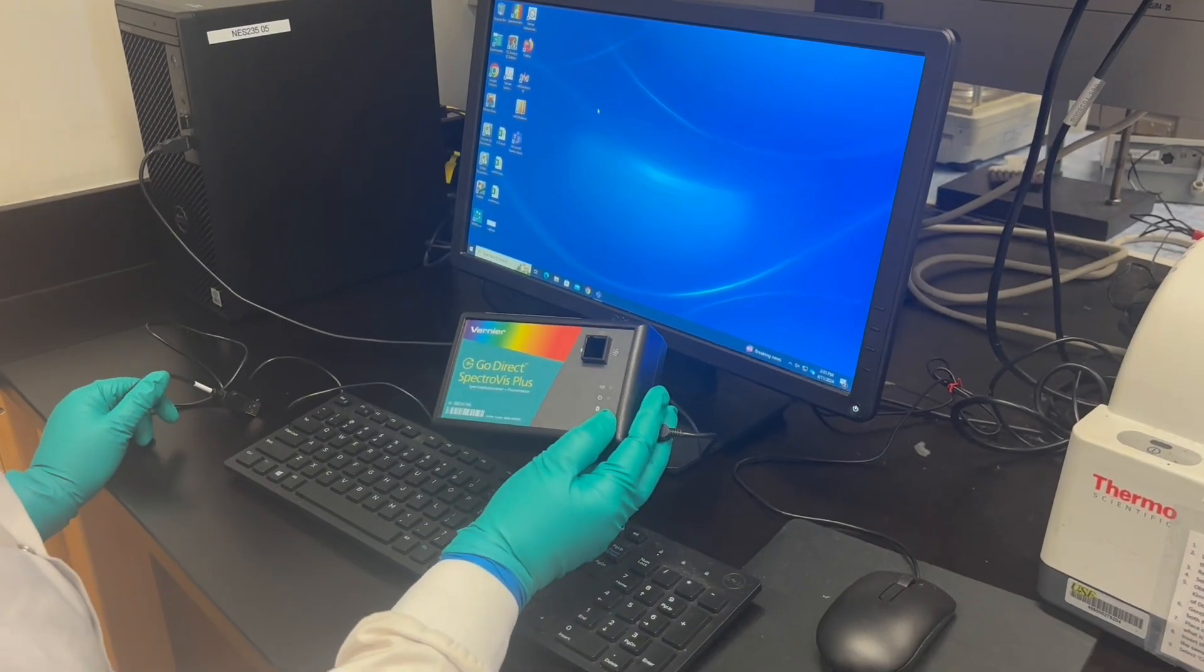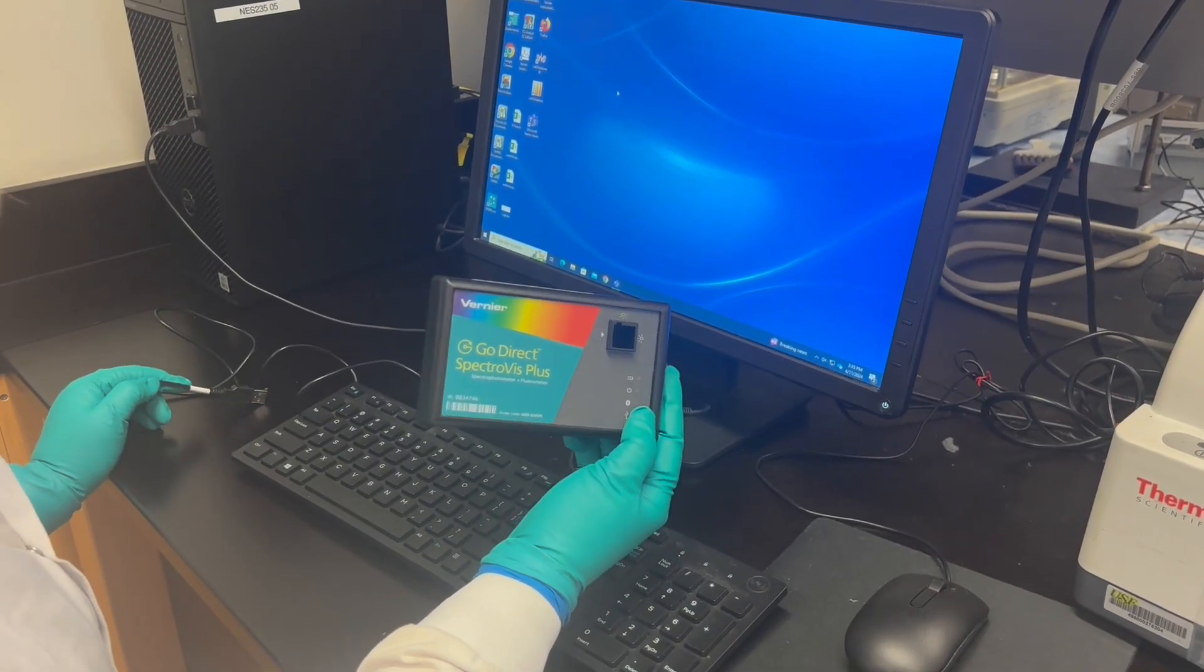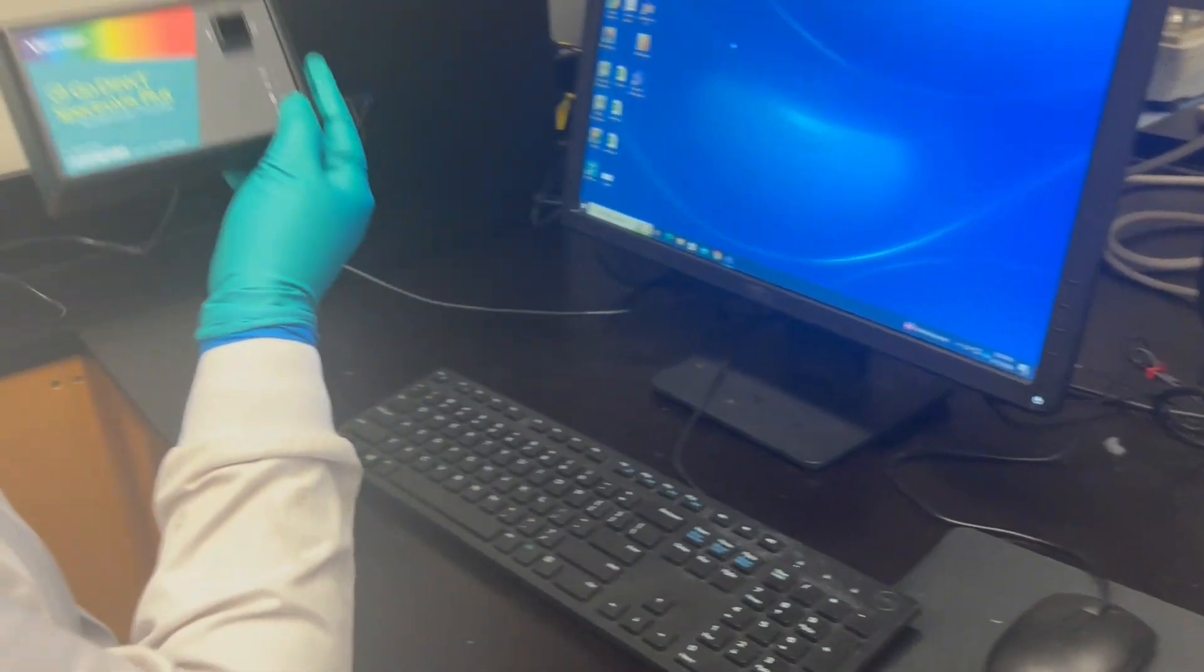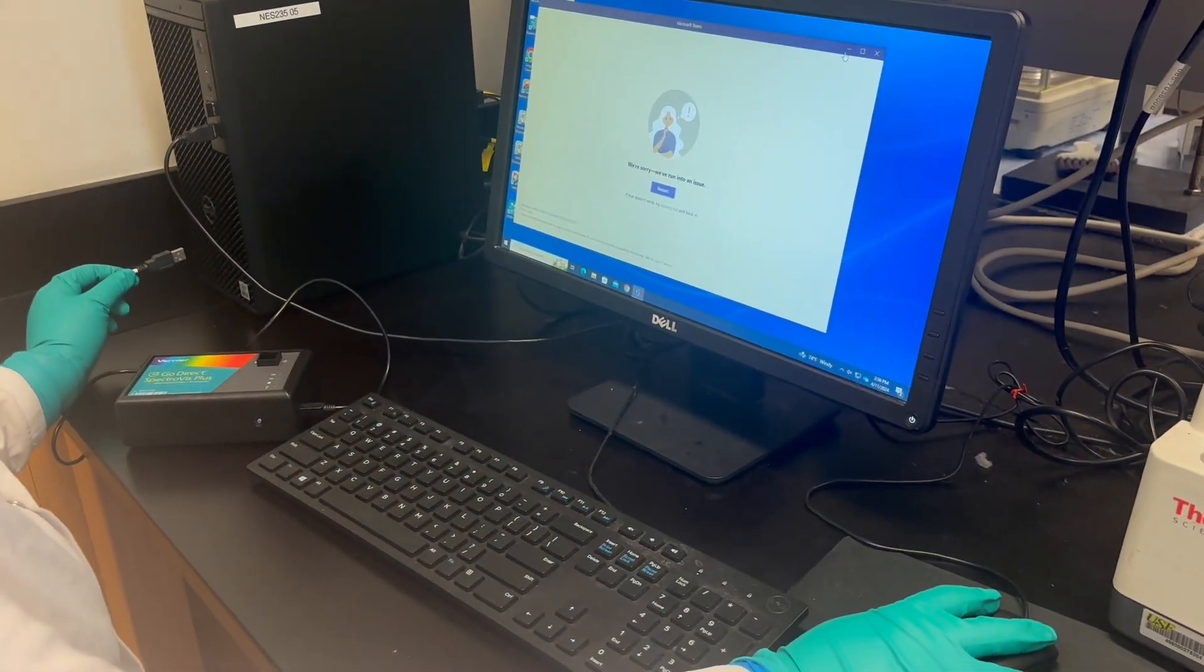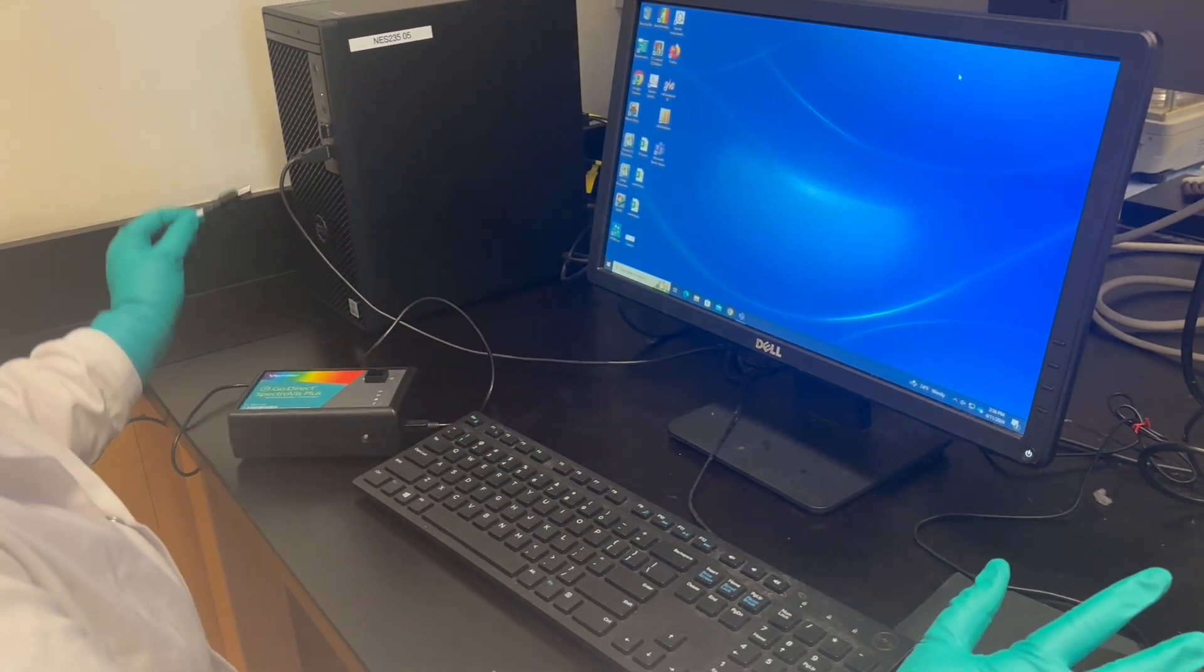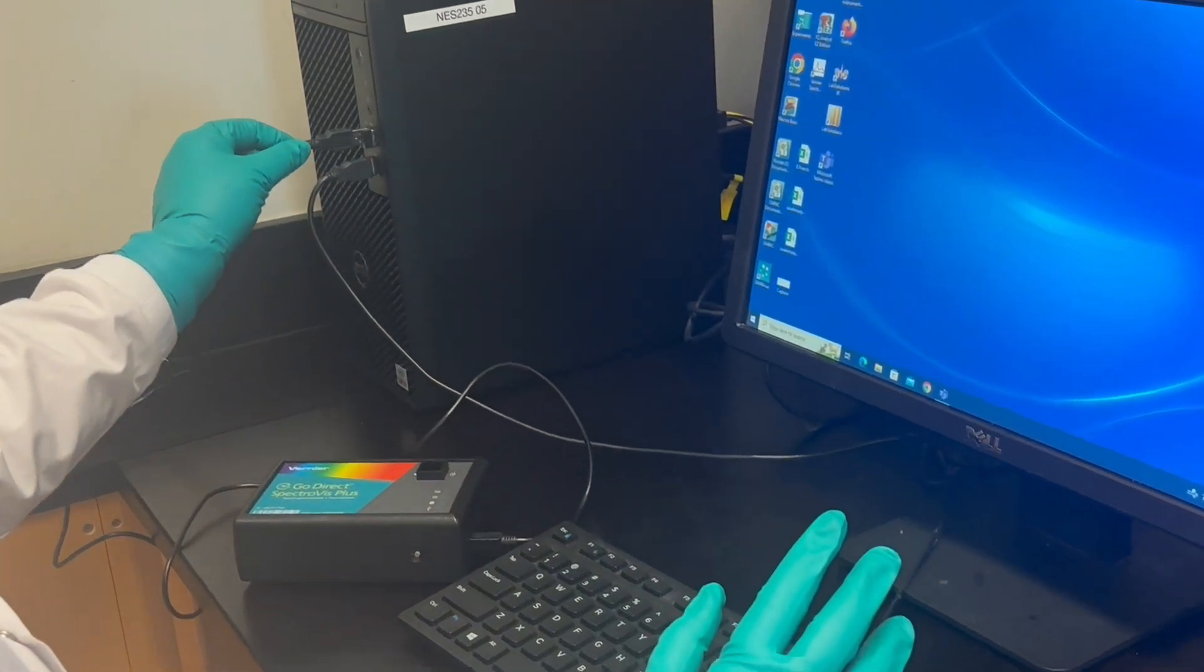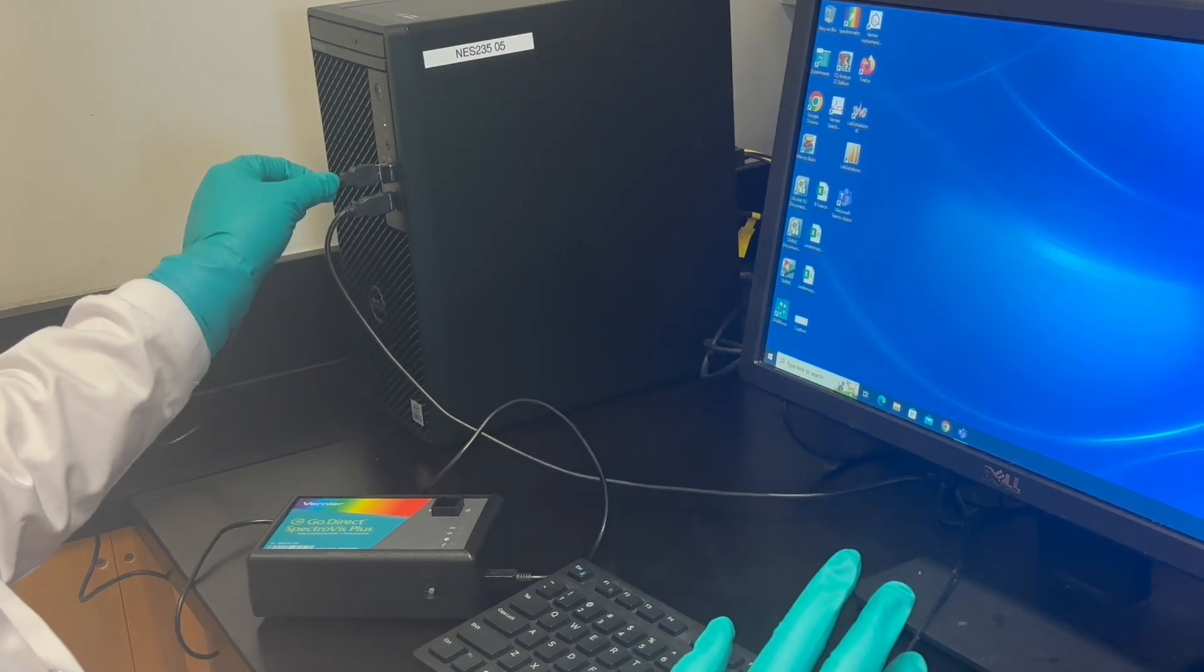We're going to be going over how to use the UV-VIS, the Vernier UV-VIS. When you first get your UV, you need to plug it into the computer like so using the USB port.